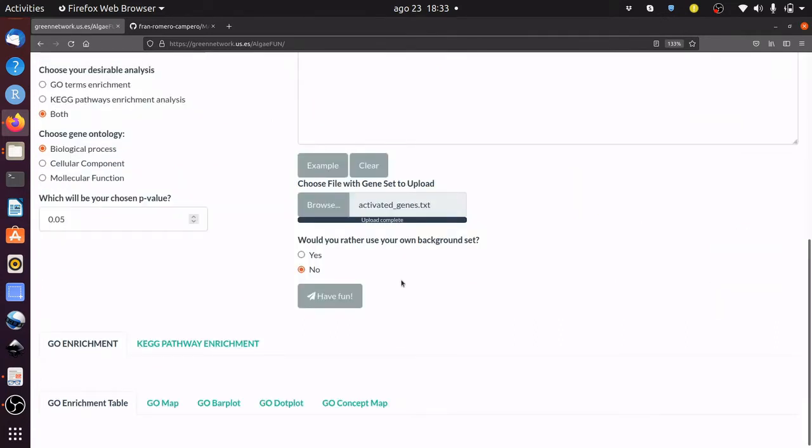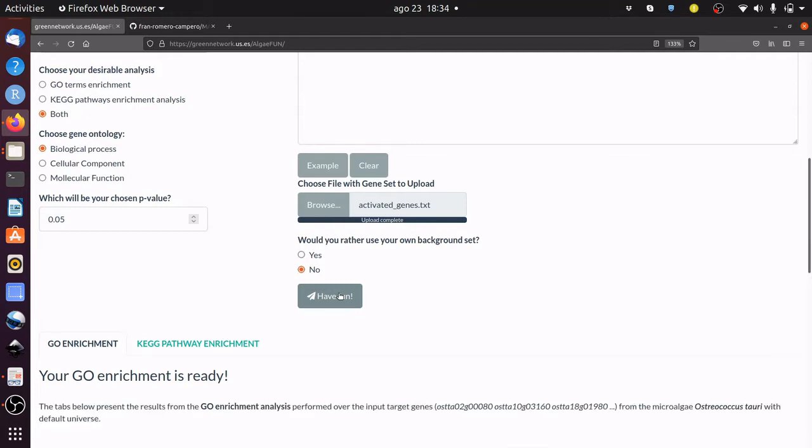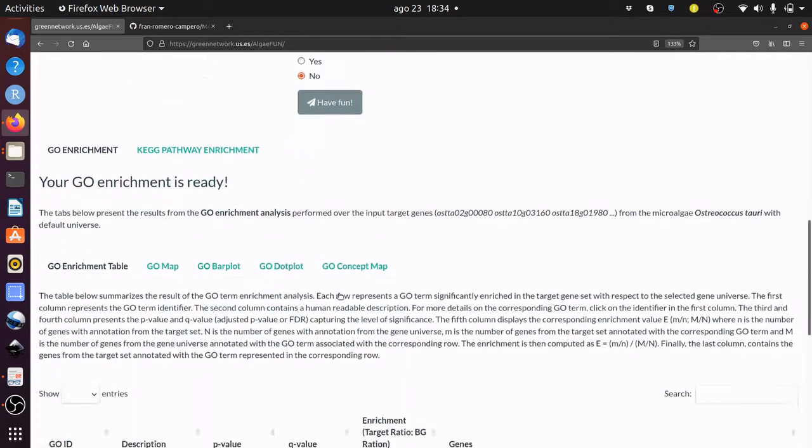A custom or the default background gene set can be chosen. Click on the Have fun button to perform the functional enrichment analysis. Please be patient while the analysis is carried out.